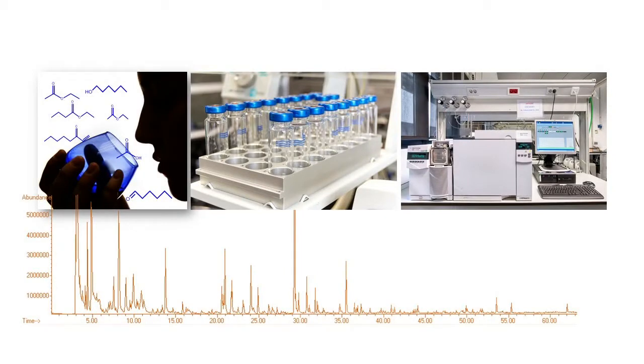A method has been developed for the determination of the content of selected volatile compounds in virgin olive oils. Volatile compounds are responsible for the aroma of virgin olive oil. Therefore, the detection of sensory defects can be explained by the presence of specific volatile compounds that are directly responsible for negative attributes.